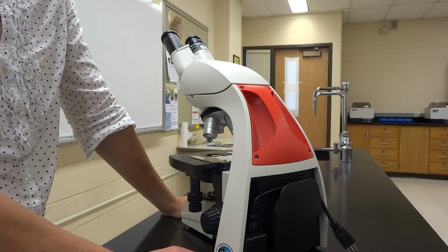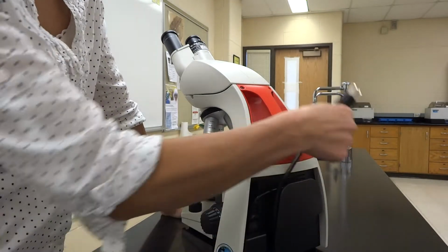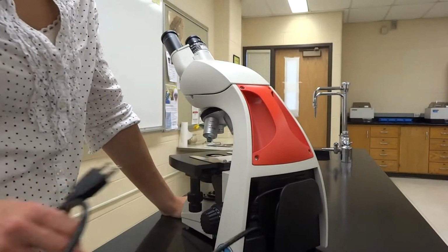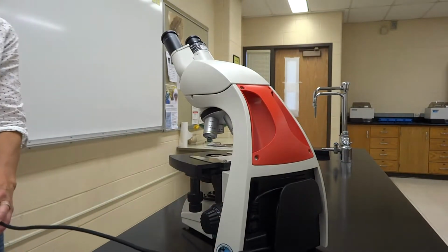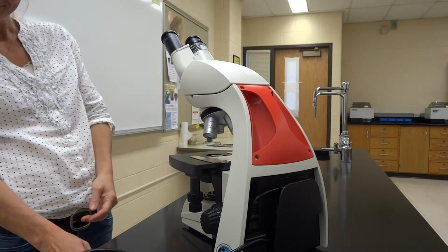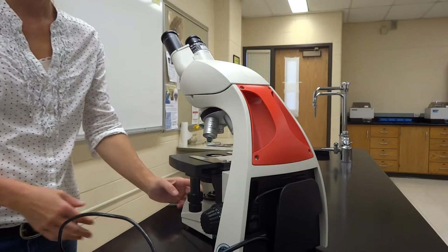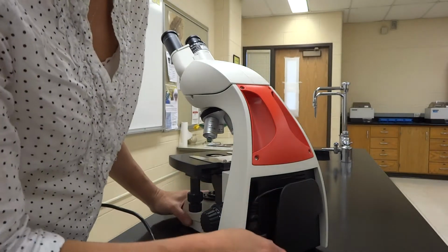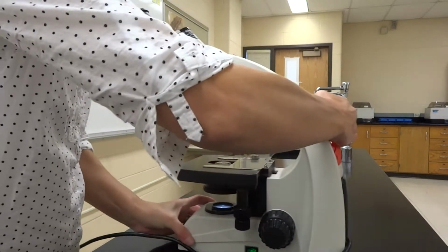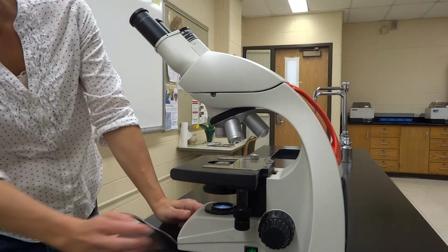So first thing you need to identify and find would be the plug. Electricity is important. So you unwrap your cord and attach it to the plug. The plug just goes into the electricity. So plug it in and then try to turn it on. The on switch, remember we identified before, is right at the bottom. And what should happen is you get the little light that pops out from the bottom.